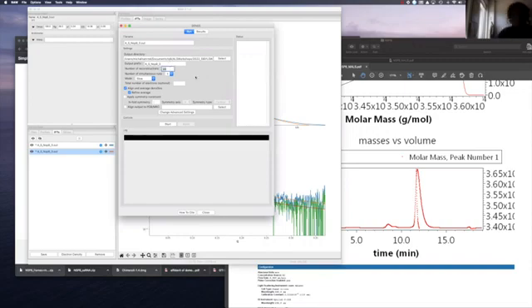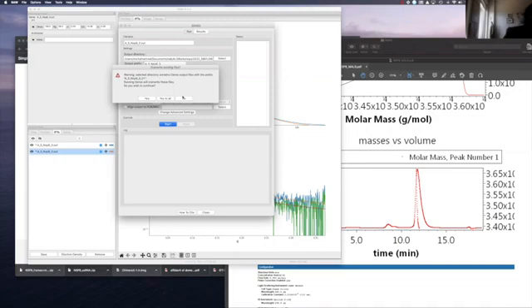For the sake of time, I will not start it, but it takes about, oh, why not? We're going to put it in a fast mode, and we're going to calculate only 5 reconstructions. I know it is almost a monomer with about 20 something, but I don't apply the symmetry in this case. I will keep just the 5 reconstructions running in a fast mode, and I will not do refinement because it takes a little bit longer. And I will use only one CPU, just in case you don't have multiple CPUs.